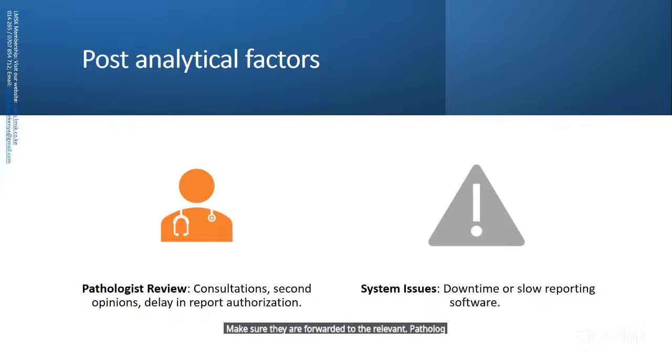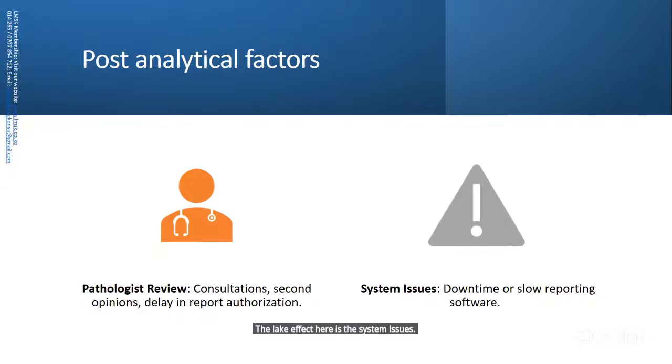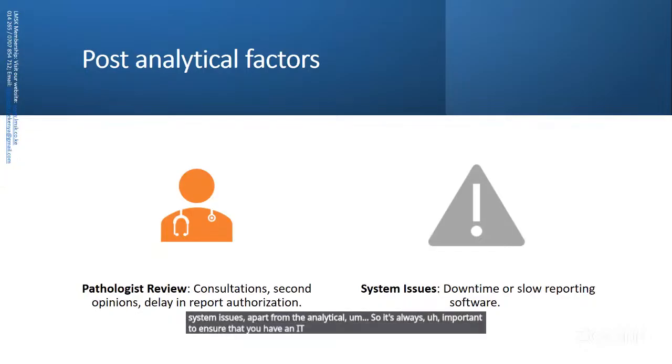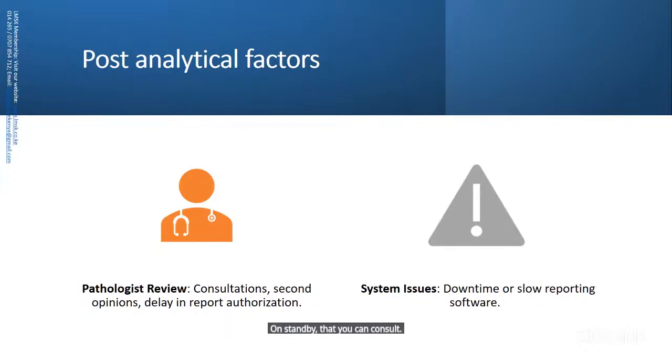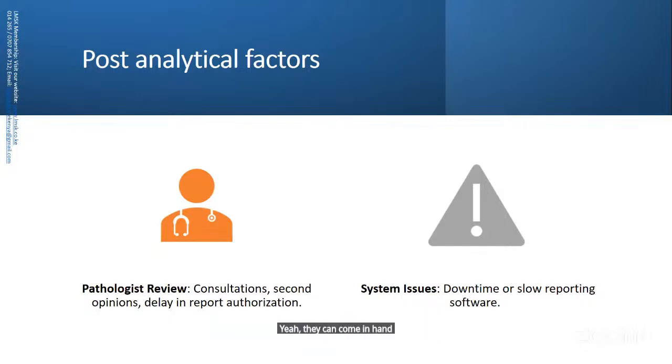Then another thing that will affect TAT is the system issues, system downtime, slow reporting, software, and all that, apart from the analytical factors. So it's always important to ensure that you have an IT expert on standby that you can consult the moment you realize the system is down, so that they can come in handy and resolve the system issues.